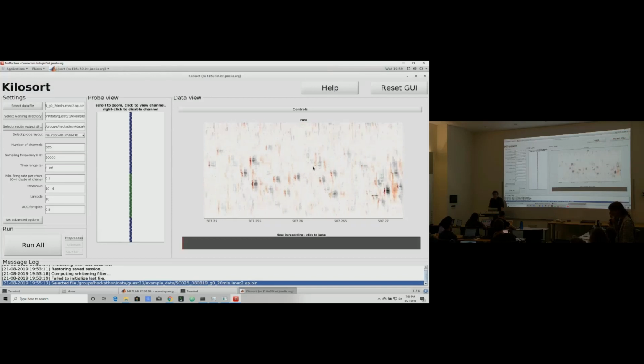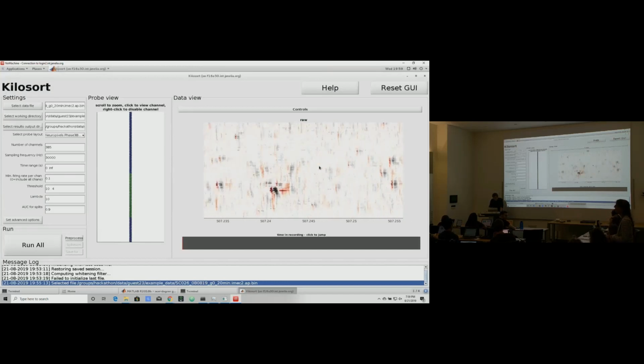Where would this be, Susu? What brain area? Where's Susu? This is the thalamus? Okay, so I guess, yeah.